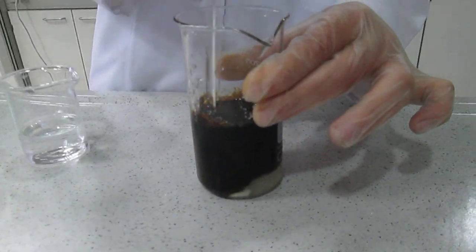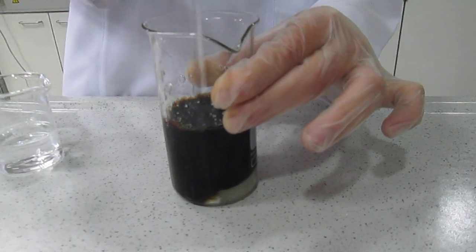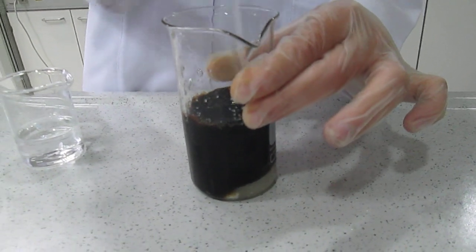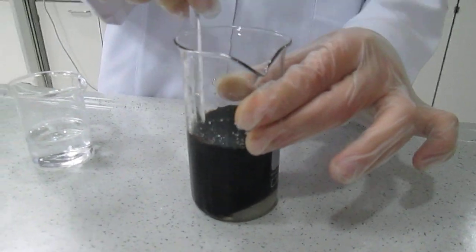As the acid goes in, the sugar quickly darkens because water has been removed from the sugar and black carbon has formed.